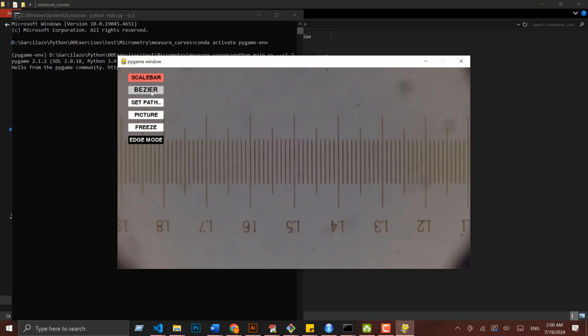Now I can click on the Bezier curve. This replaces the straight line. The first thing that I want you to notice is that this is a lot like the Illustrator tool called Pen. This not only is part of Illustrator, but also many other programs that allow you to project vectors or lines or curves, is based on the principle of something called the Bezier curve.